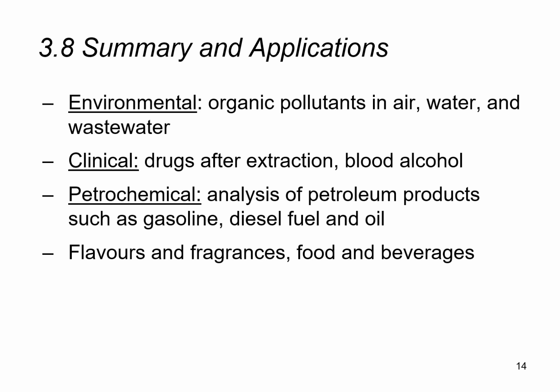So as we close this topic, I just want to highlight that there are very wide-ranging applications for gas chromatography. It's certainly not limited to these three areas here: environmental, clinical, petrochem, food. It's certainly used in almost every industry you can think of, right? Because there are so many compounds that are suitable for gas chromatography, and also this instrument technique is quite an affordable technique for many companies to use.